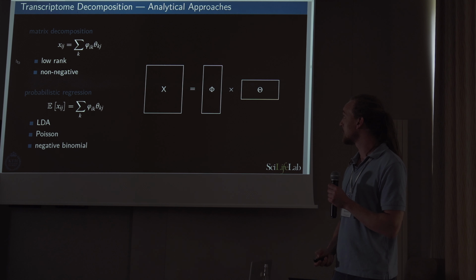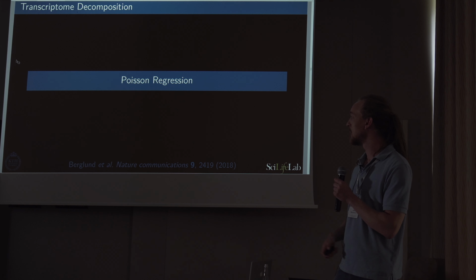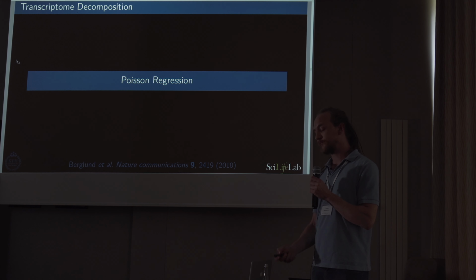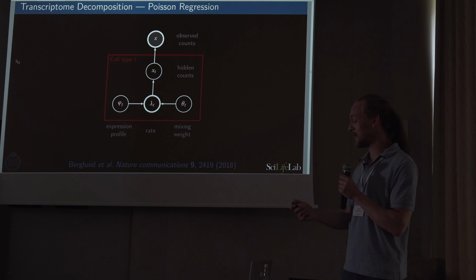So with this, let us turn to Poisson regression, which has been described in this publication in which we applied it to prostate cancer. But I won't be having any further pictures on that. You would have to go back to the title slide, that picture that I had.